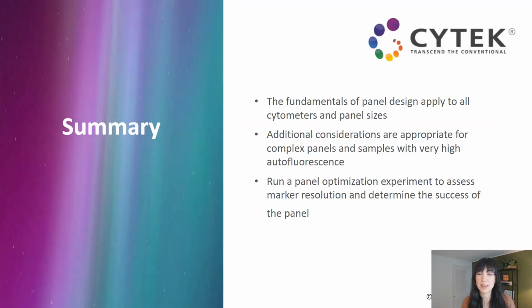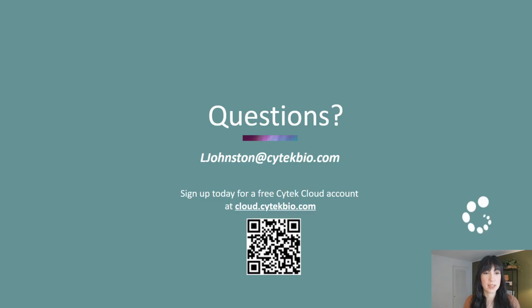So quickly summarize, I know we're running out of time. I went through the fundamentals of panel design and how they apply to all cytometers and panels of all sizes. We went through some additional considerations that are appropriate for complex panels and samples that have very high autofluorescence. And we talked about how you can actually run a panel optimization experiment to assess marker resolution and figure out if your panel is successful. So with that, I could take a couple questions.